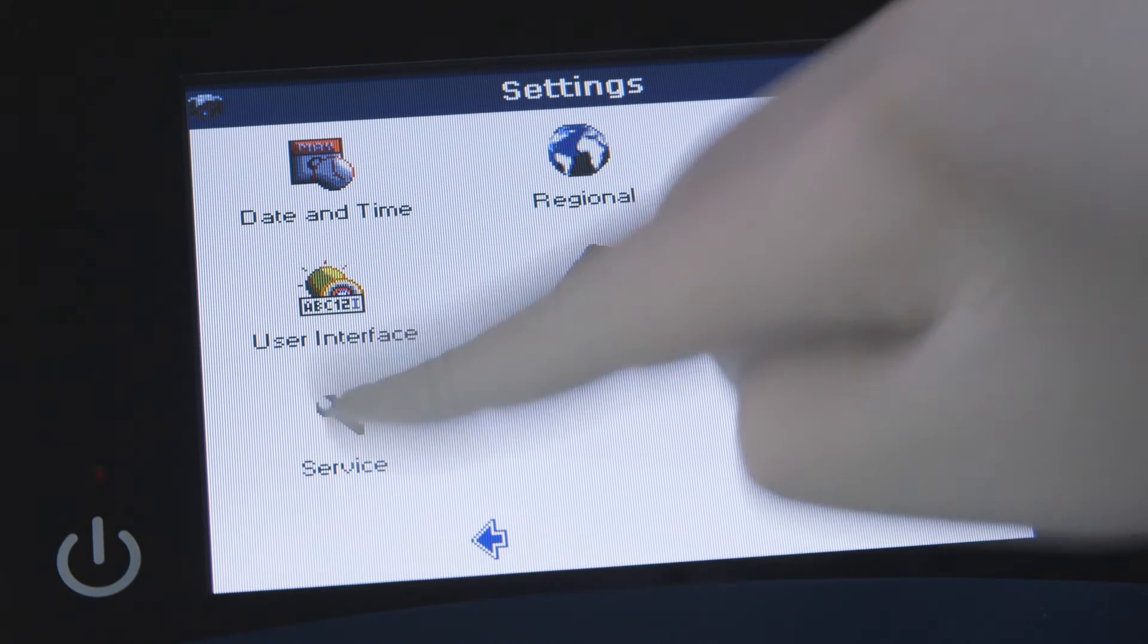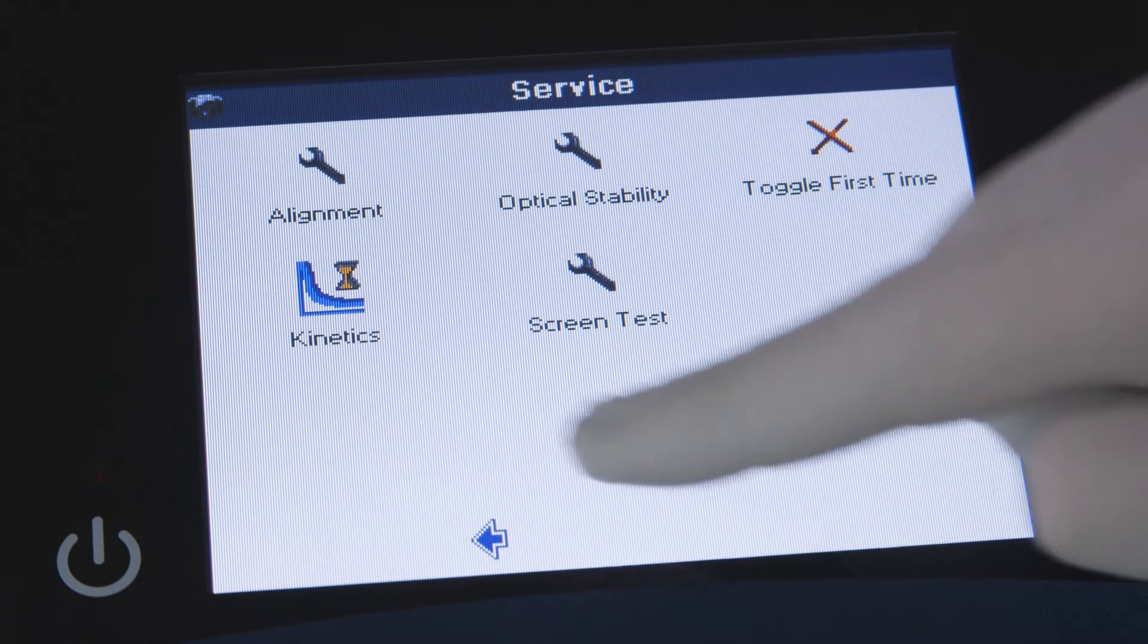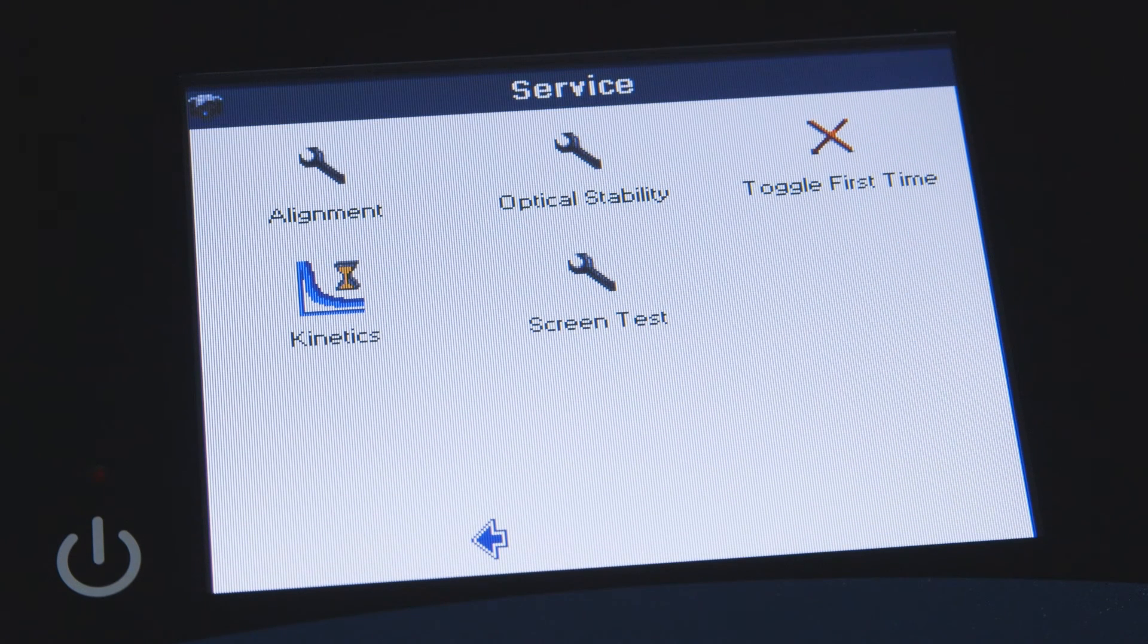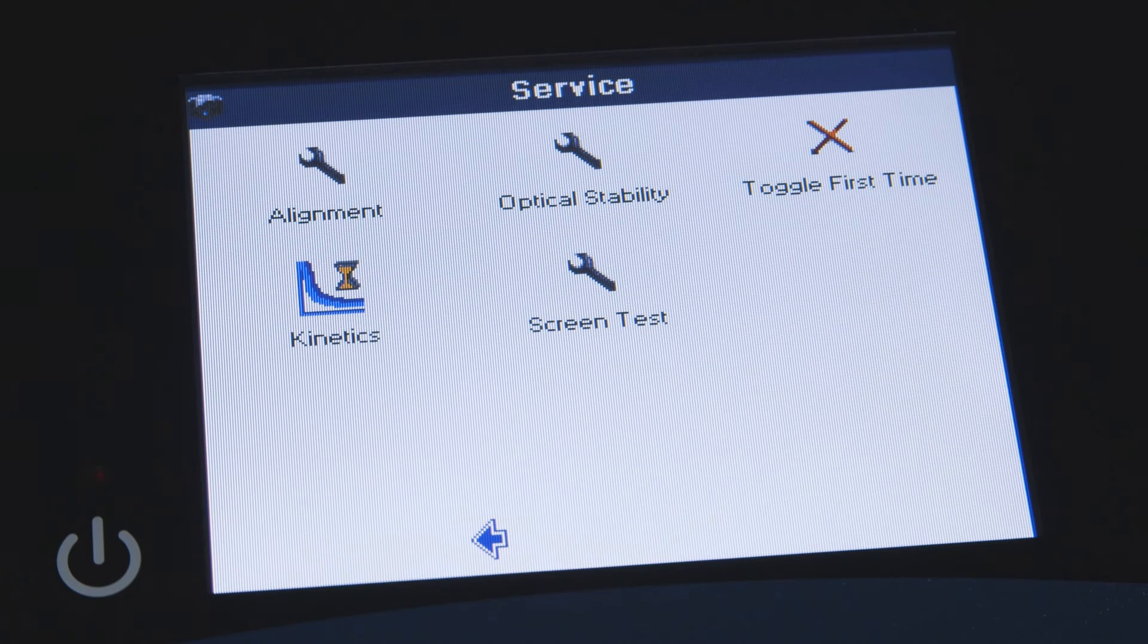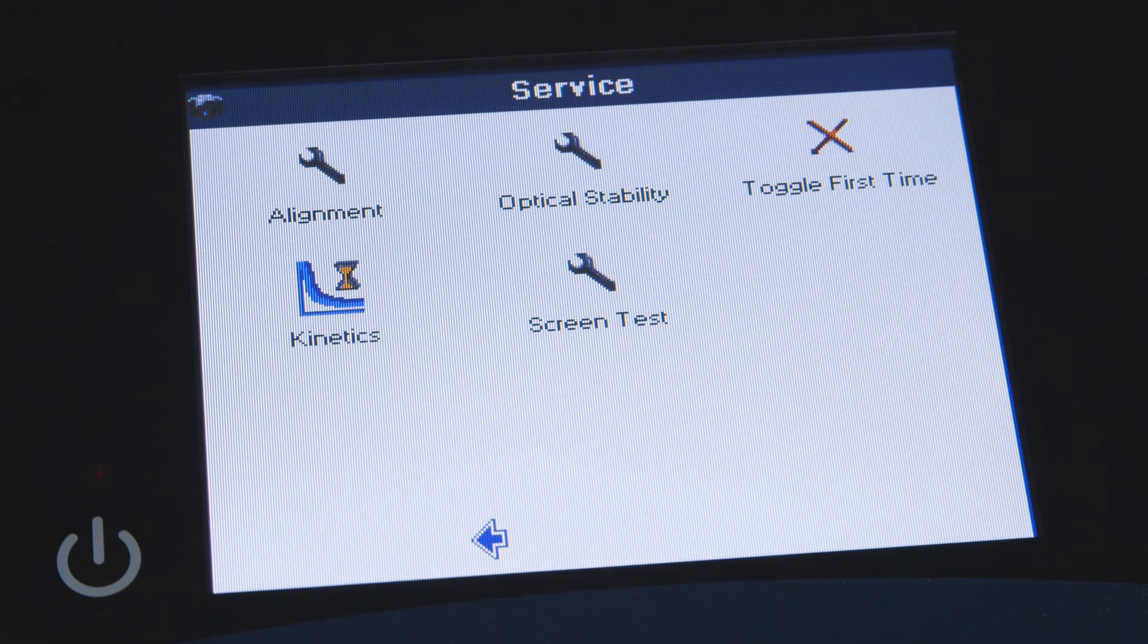Finally, there's a service menu option. However, we recommend that it is only accessed by trained service engineers or upon recommendation of technical support.